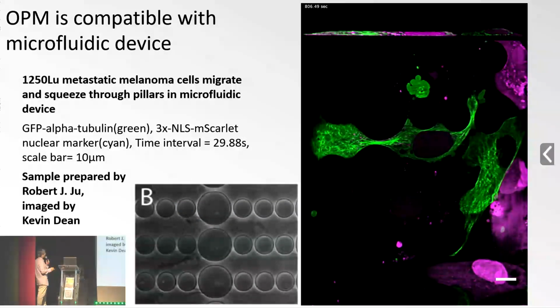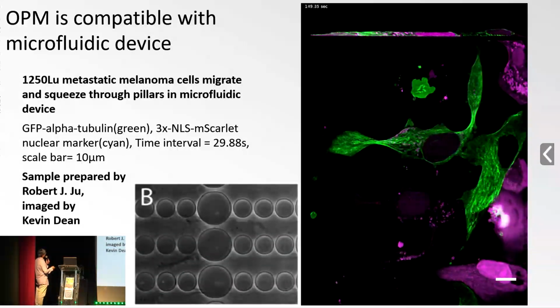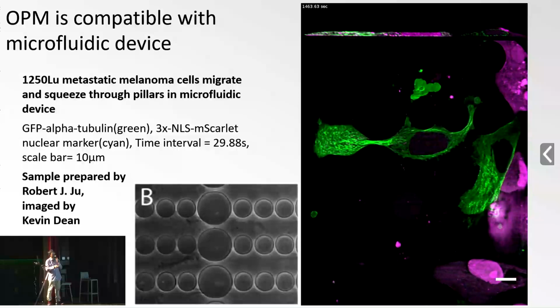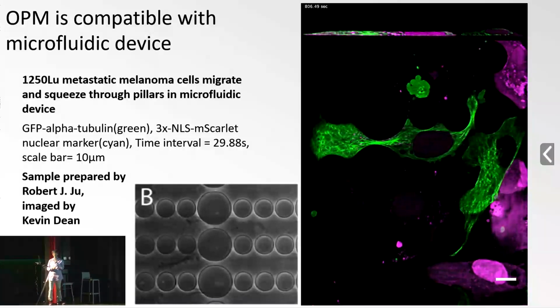And because of the OPM, now we can put regular samples on the system. So here is a microfluidic device. These cells try to squeeze through this little pillar here. And we can also image that with this OPM system.